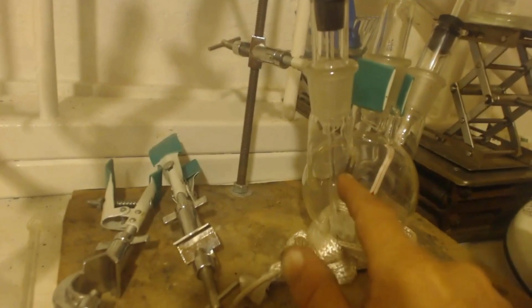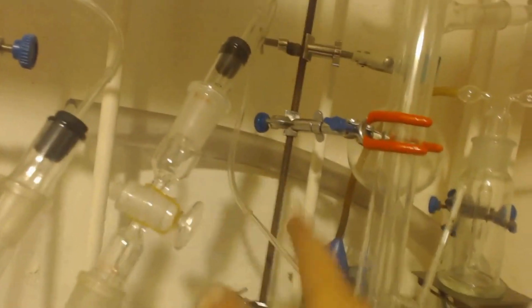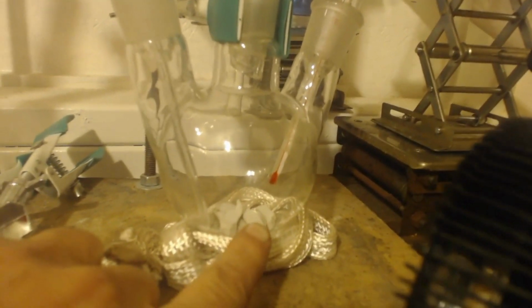Anyways, it comes up here to another tube and then down to here. And all my tubes that are inside are glass, okay? The attachments to attach them from one place to the other are plastic, though. And this tube goes all the way to the bottom. I don't know if you can see. And that's a 3-neck flask, right? So it comes in, and I'll have my DCM in here, my dichloromethane, and I want it to be tetrachloromethane. I want to add 2 chlorines to it.